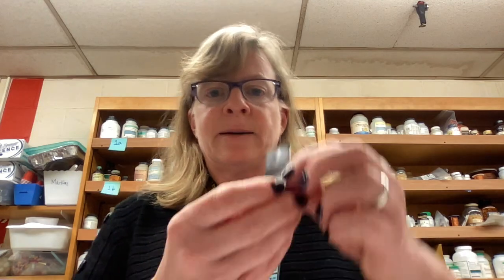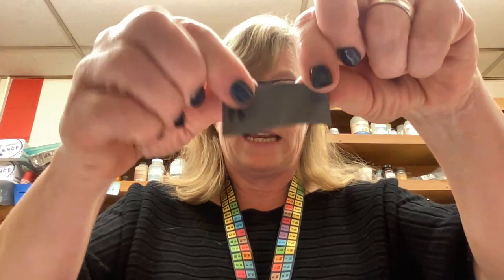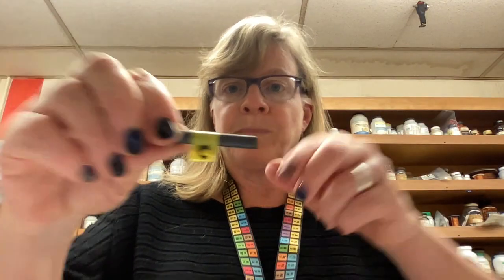Okay. Sample F is PB. It is lead. You can see again, it's sort of gray. It is shiny and it is malleable. It's also a little heavier than some of the other ones. It's lead. And sample G is carbon. There you go. Carbon. It's not malleable. It's sort of a black gray. It is not magnetic and not malleable again.